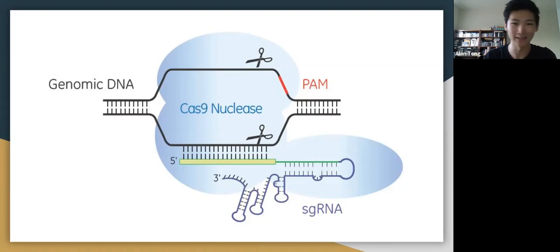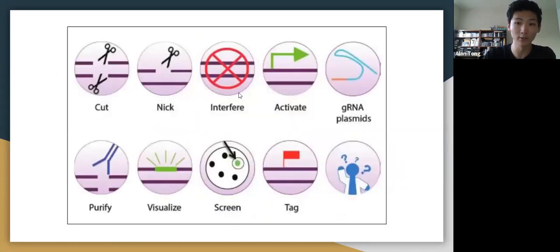What's the new catchphrase? Cas9 is your oyster. Answer: oh, can we have the cell make new genes, like combine two separately cut pieces of DNA? I'm not sure about the ligation efficiency of the Cas9 nuclease, but yes, definitely, if you want to cut pieces of DNA, that could definitely be a programmable way to cut pieces of DNA. Yeah, definitely. So here are all the different ways you can do this, right?